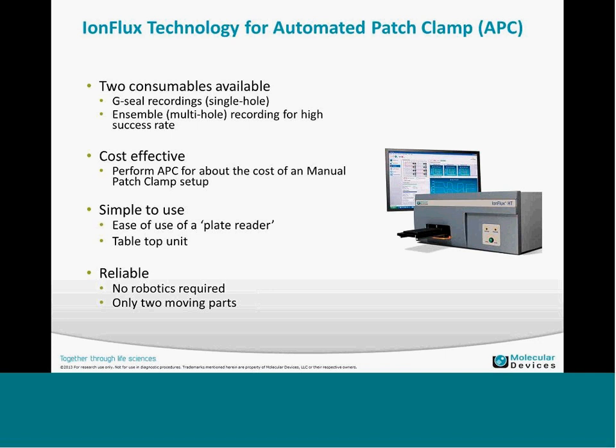Here's a movie I was telling you about. So this is the trapping of the cells, and this is an ensemble recording. Essentially the cells are being trapped onto the 20 what are analogous to electrodes at each trap. You're looking on the left at trap 1 with 20 electrodes, and on the right a portion of trap 2. And you can see that the cells are being pulsed back and forth and being drawn into where the holes are that are analogous to the electrodes.